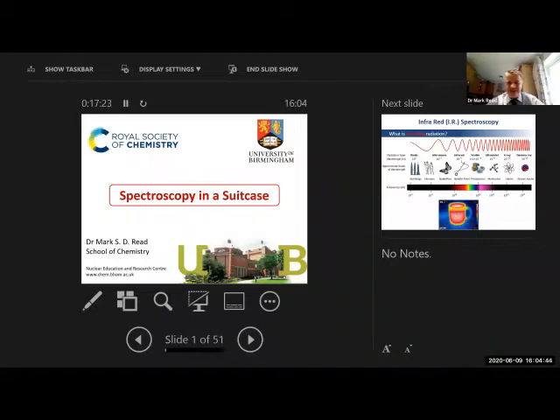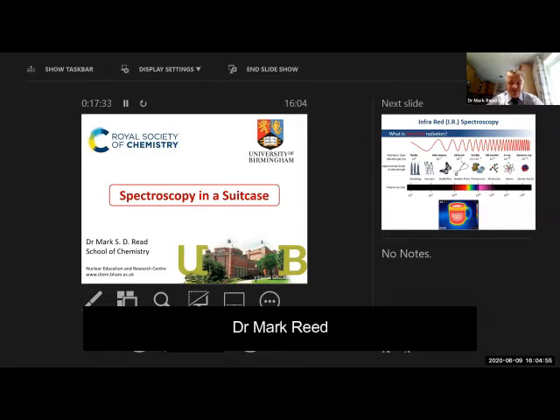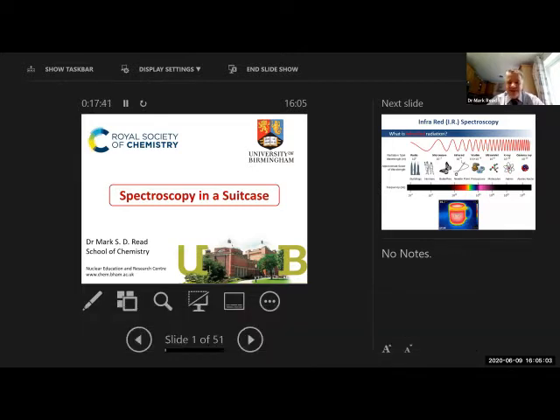Well, thank you very much for that introduction, and welcome. Can I just check everyone should be able to see my screen of my presentation? So normally around this time of year, we visit schools giving this hands-on spectroscopy in a suitcase workshop where it links in with the A-level syllabus. A-level year 12 and year 13 students actually get the chance to run their own infrared spectra. Because of the current situation, obviously we can't do this, but we've got the next best thing.